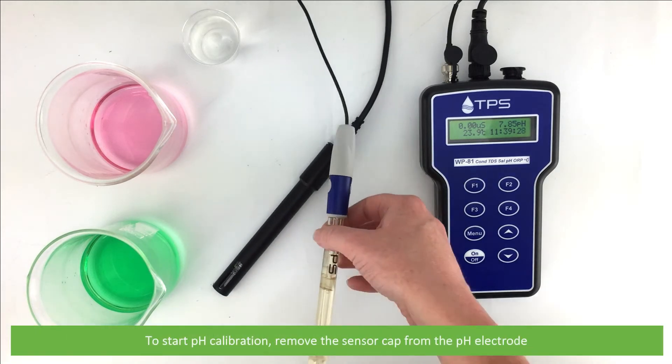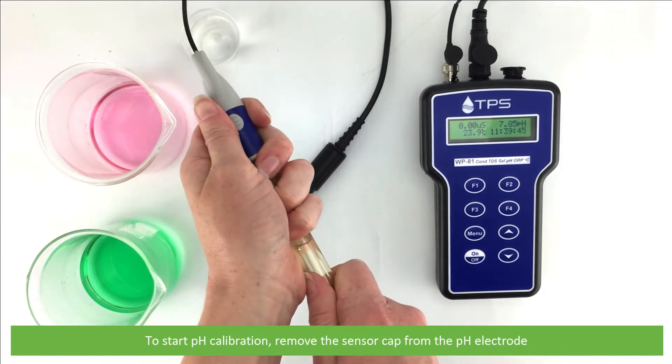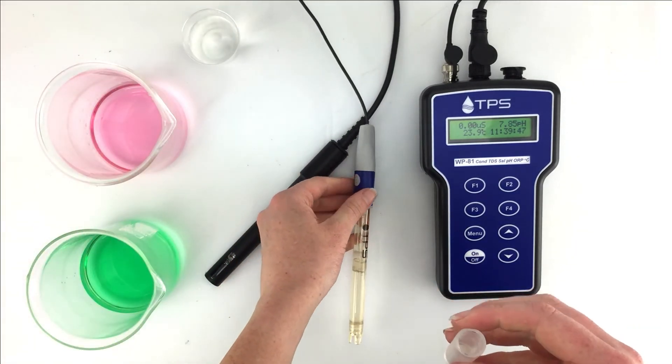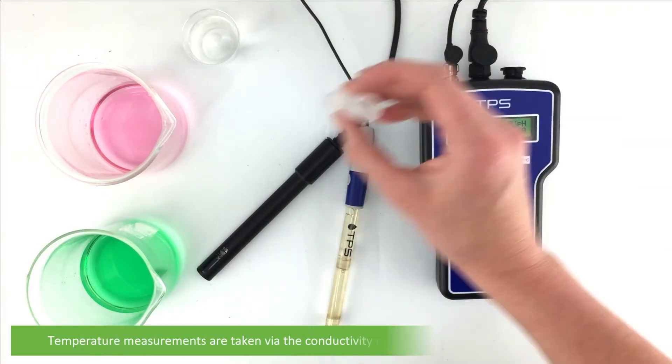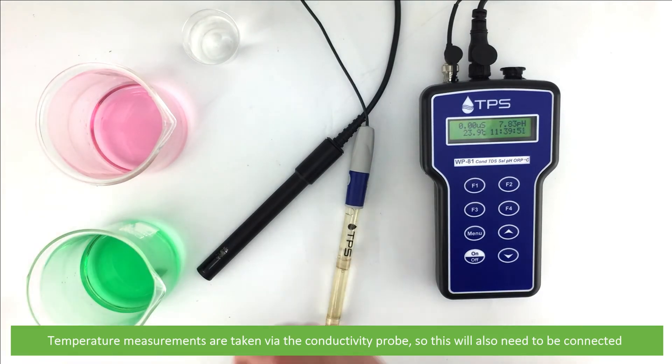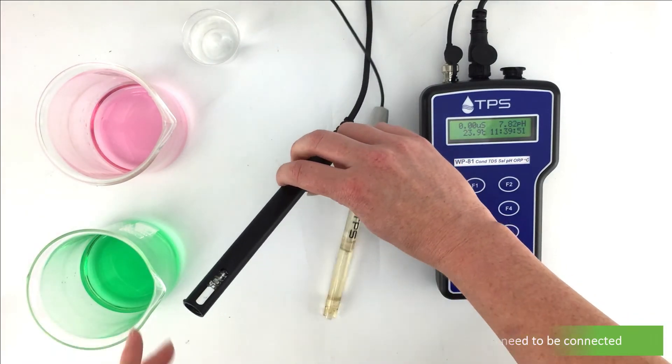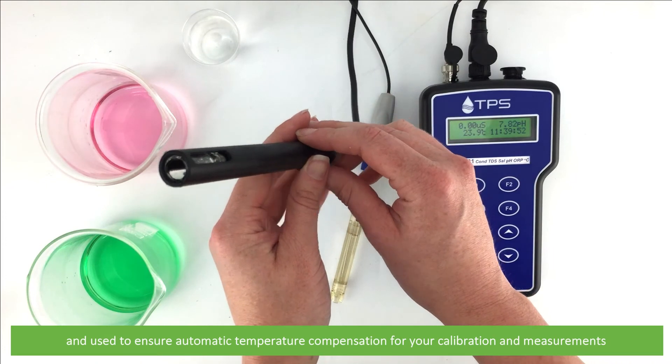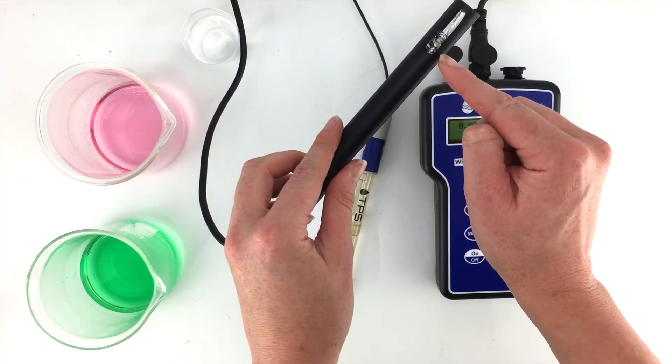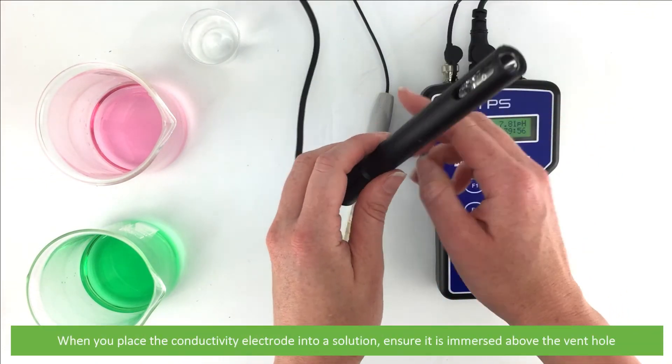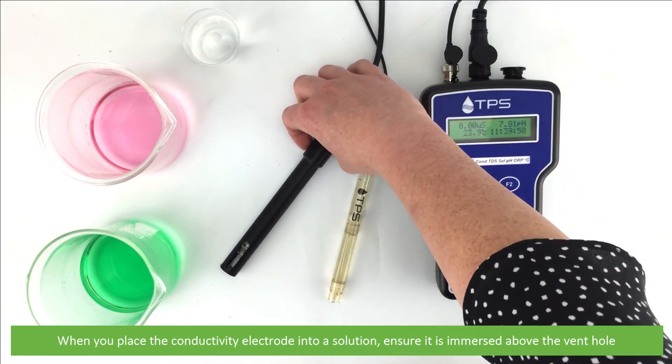To start pH calibration, remove the sensor cap from the pH electrode. Temperature measurements are taken via the conductivity probe, so this will also need to be connected and used to ensure automatic temperature compensation for your calibration. When you place the conductivity probe into standard solution, ensure it is immersed above the vent hole.